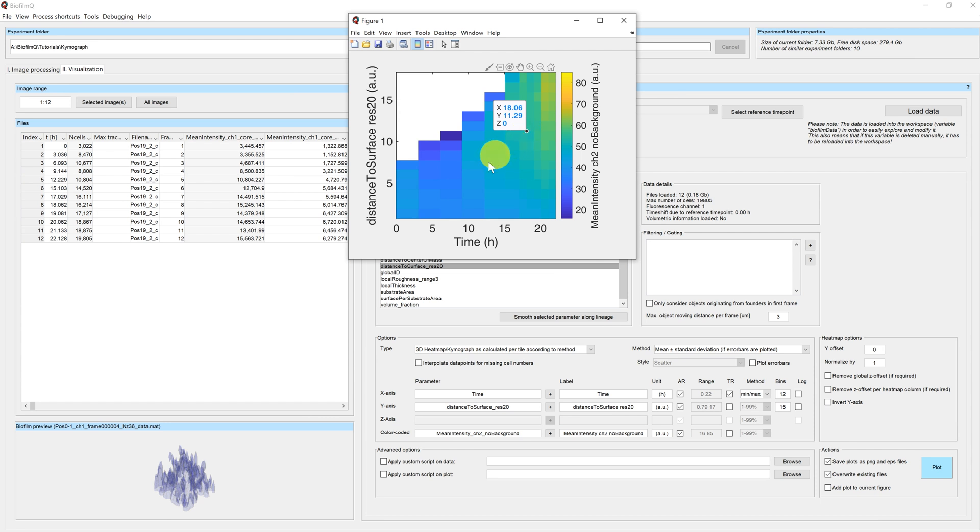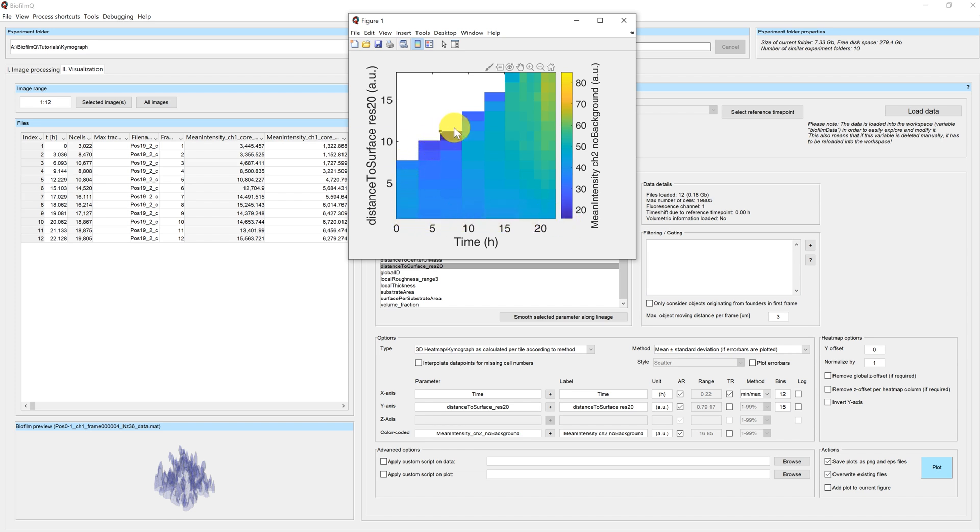However, here, since we're measuring the distance to surface, the value 0 corresponds to the surface of the biofilm. And these areas here are not the outer areas of the biofilm, but actually the innermost areas.